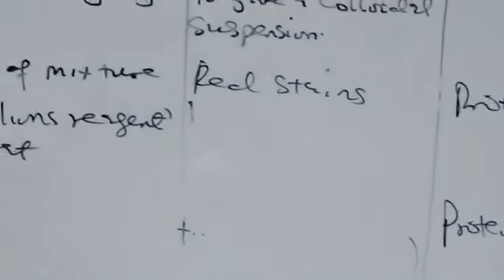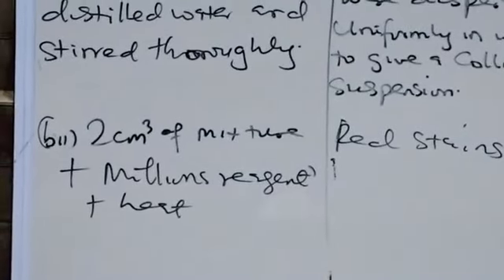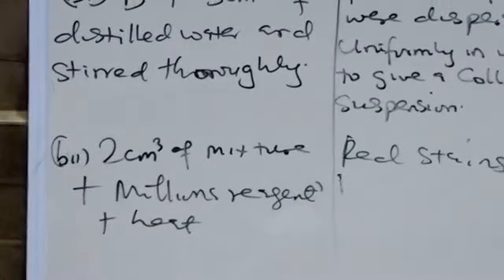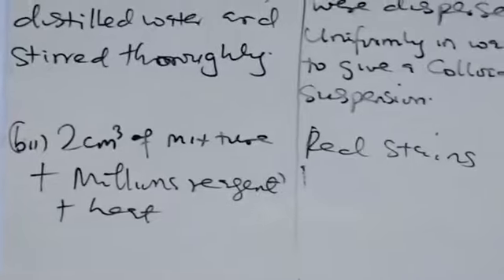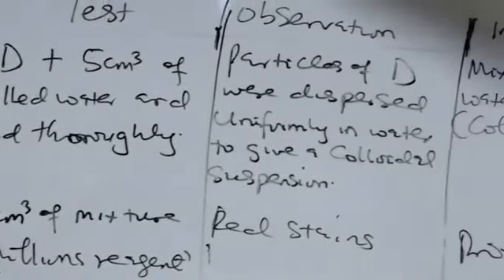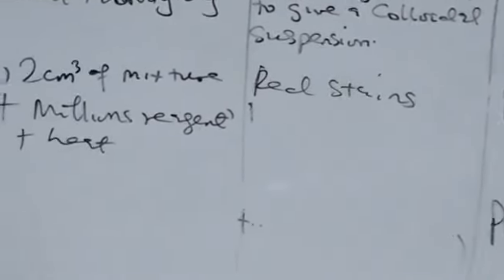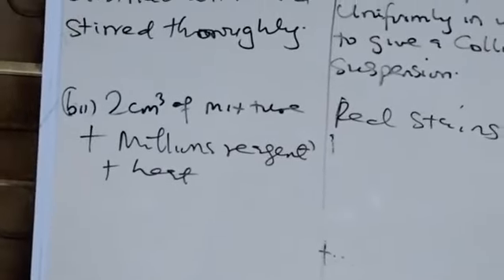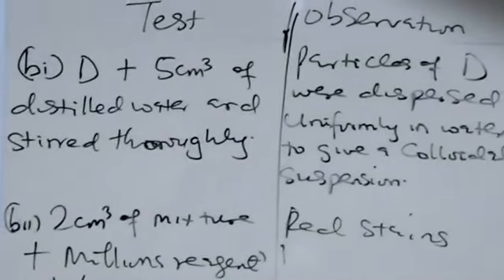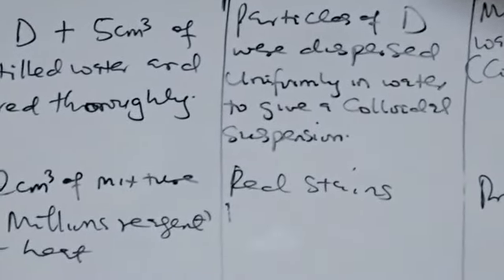Having done this, before we finalize this practical work on qualitative analysis, we're going back to C, that is specimen C from 2A, which is zinc chloride. We're going to perform the test on C aqueous, that is C dissolved in water, using lead nitrate in place of silver nitrate.